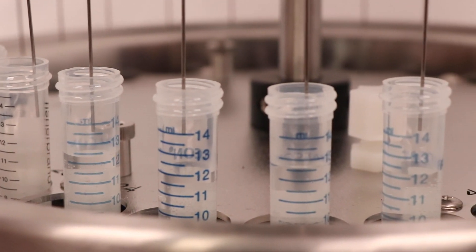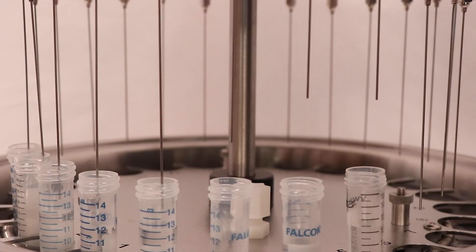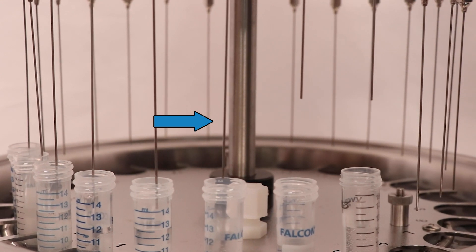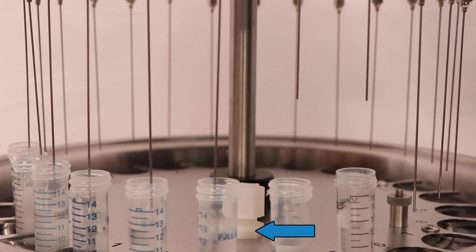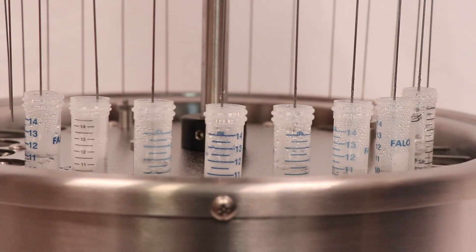Some nitrogen evaporators utilize a dry block instead of a water bath for the heat source. The gas delivery needles are then positioned to be just above the surface of the solvent. The gentle stream of nitrogen should create a dimple on top of the sample. The samples will remain in this position until they are concentrated down to the desired level.